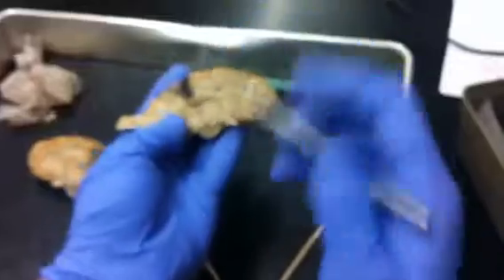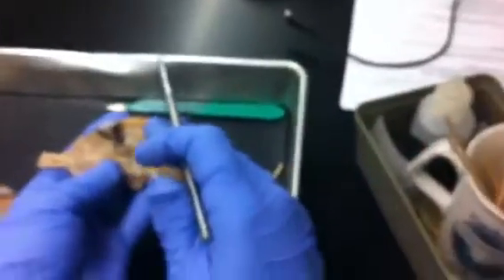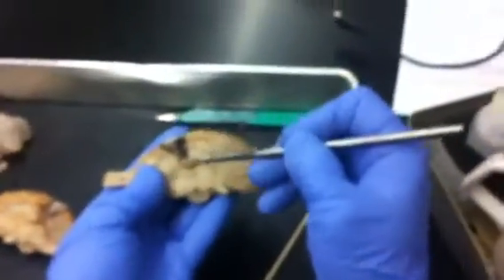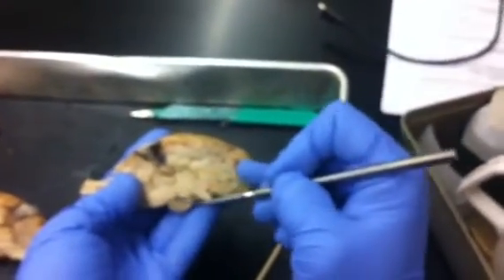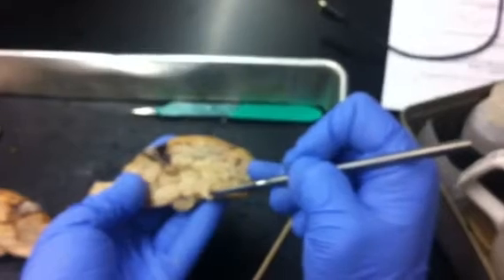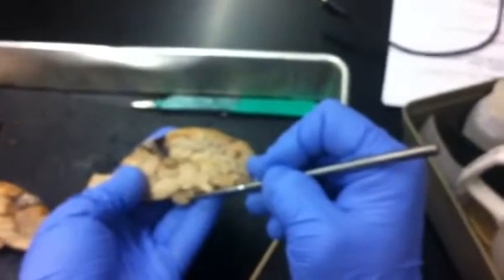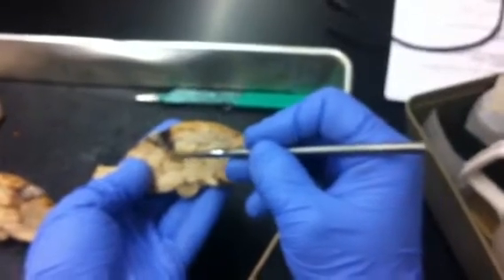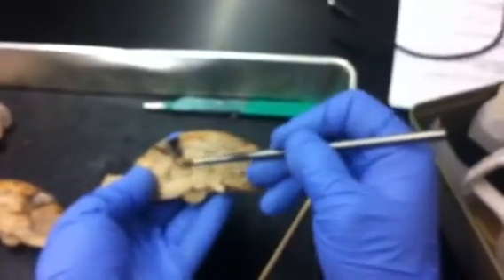And on this part, you can see the pineal gland really nice. So it's not over there. It's all on this side. Okay. Shouldn't be. Should be half and half. But again, it's hard to cut it right down the middle. So thalamus, hypothalamus, optic chiasm, mammillary body, pituitary gland, epithalamus. That brown is the pineal gland.